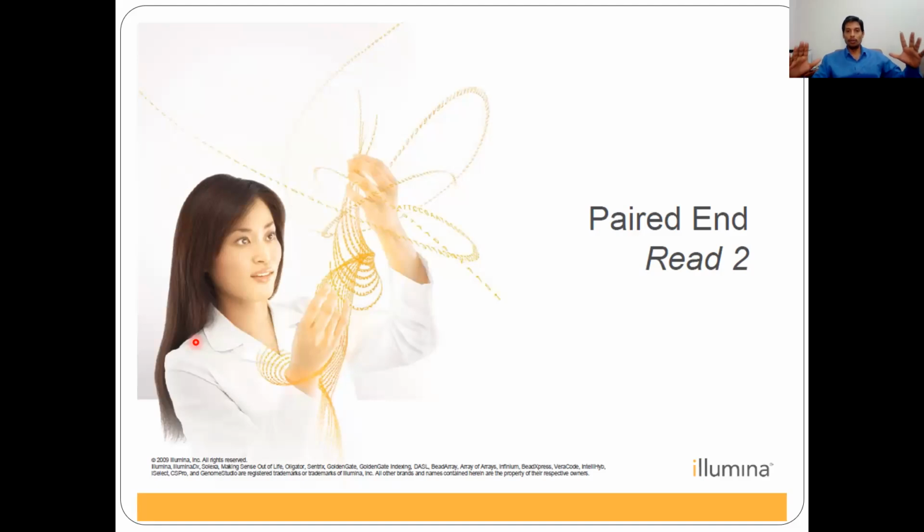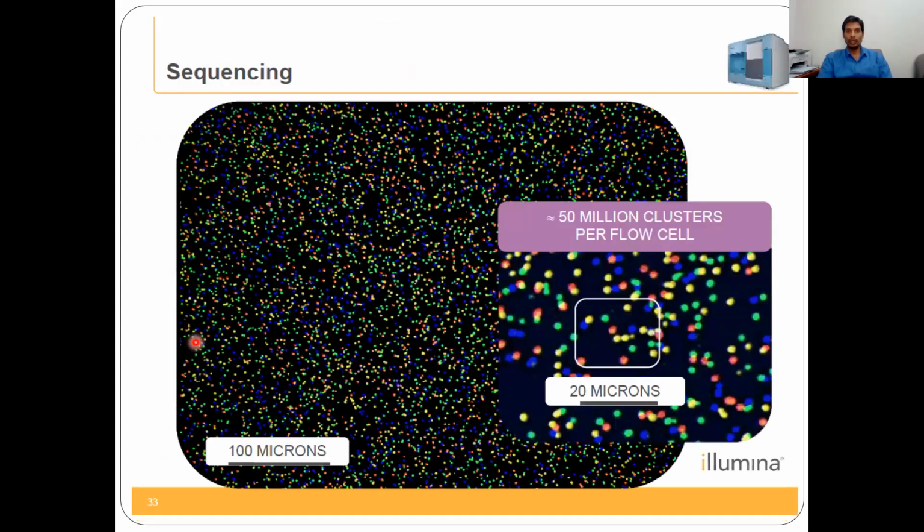sequencing of the Illumina, including the library preparation, cluster generation, then sequencing, and analyzing. Analyzing is what? Using this data, it gets analyzed which color was released and what the nucleotide would be. But at the same time, you can see that some clusters formed very nearby.